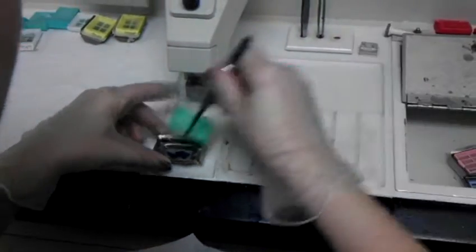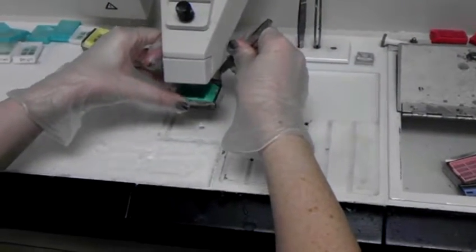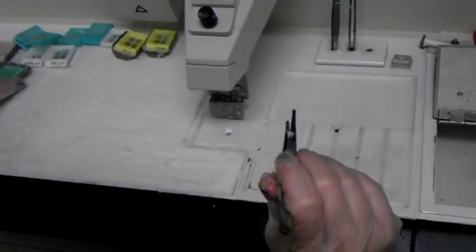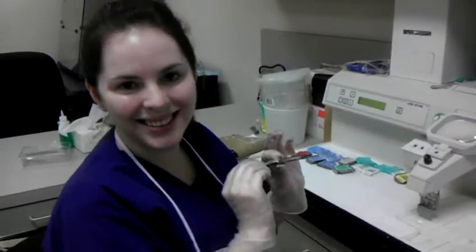Then you're going to put the cassette on top and put wax in that. You're going to tap it if there are any air bubbles on top, and then you're going to stick it on the cold plate to let it solidify and dry. And that's it.